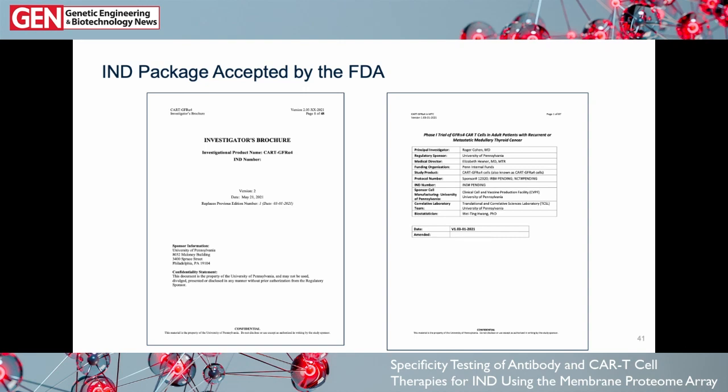Integral Molecular membrane protein array data were essential components of the IND application. A clinical trial at UPenn for MTC was put together by UPenn oncologist Roger Cohn and approved by the UPenn IRB and opened in May of 2021, coincident with receipt of IND allowance.